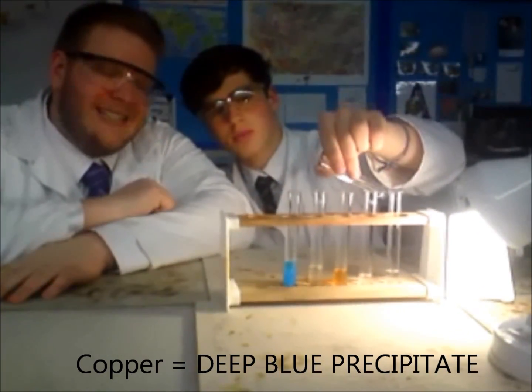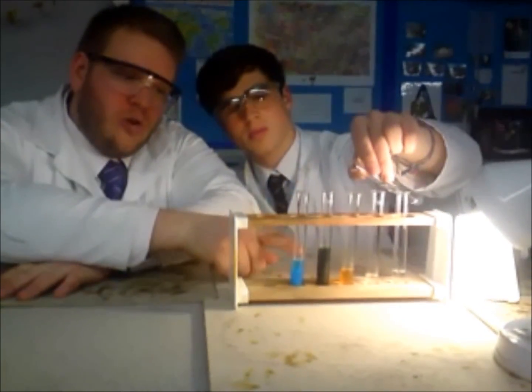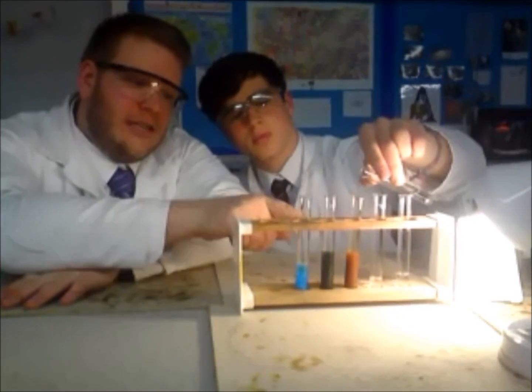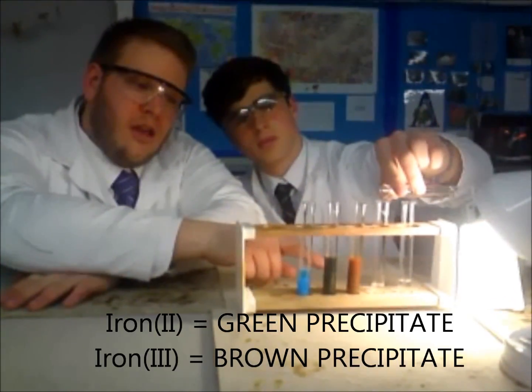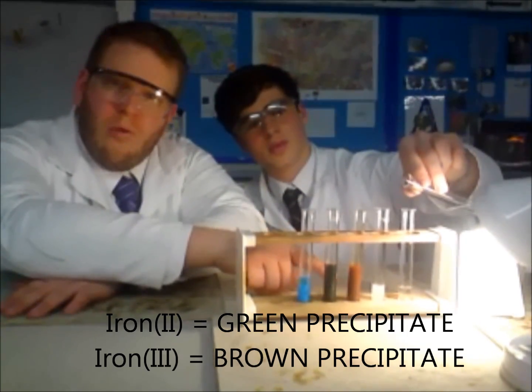Copper forms a deep blue, snotty precipitate. Iron can be a 2+ ion or a 3+ ion — this is iron(II) and iron(III). Iron(II) gives a green precipitate, whereas iron(III) gives a brown precipitate.